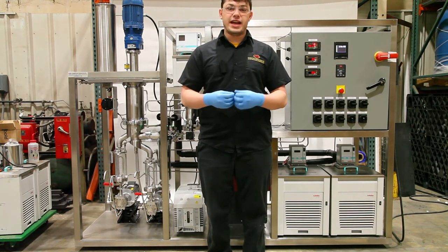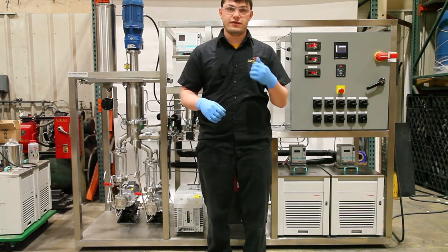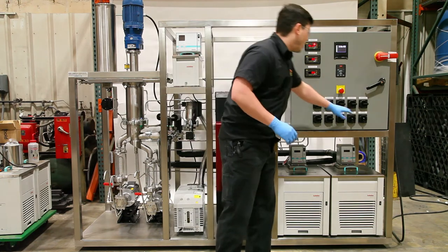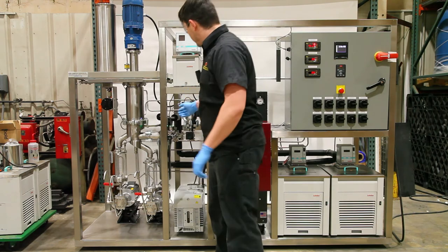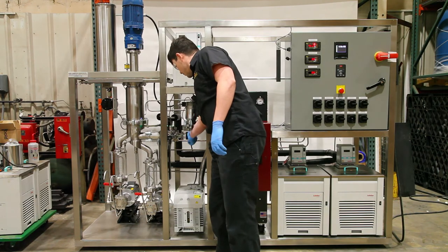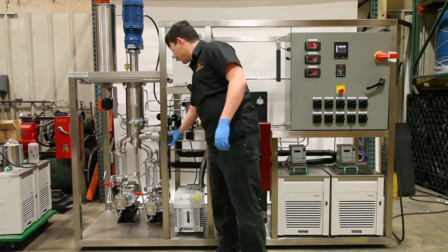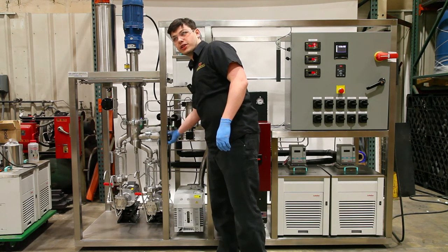Next we'll start the shutdown process of the turbo molecular pump. First thing you do is turn off your turbo pump, then you shut your turbo valve. Once that's done you can open your bleed valve and bleed your vacuum.